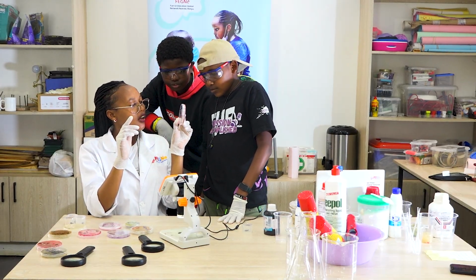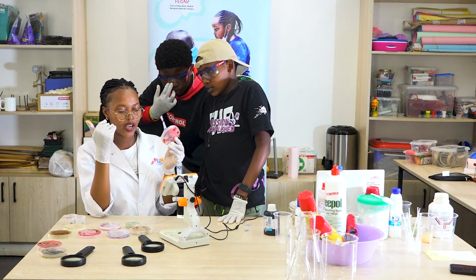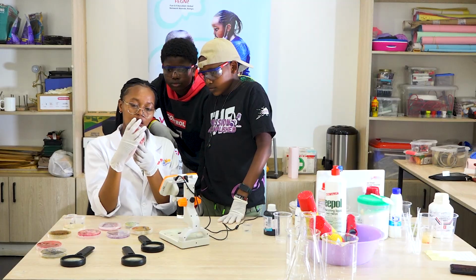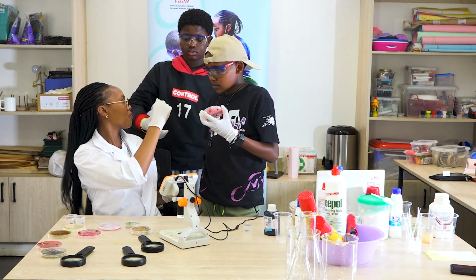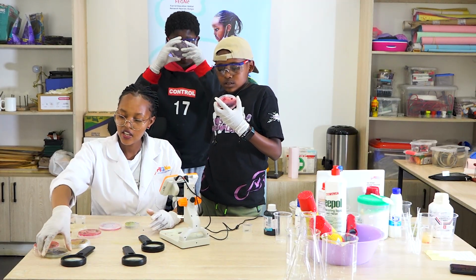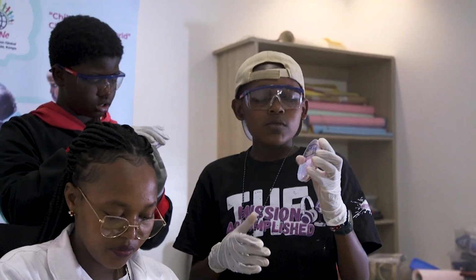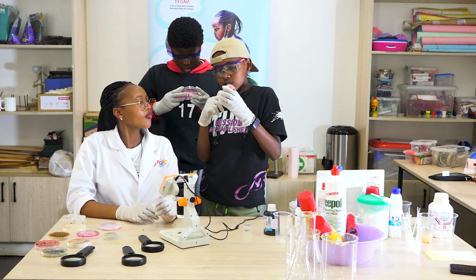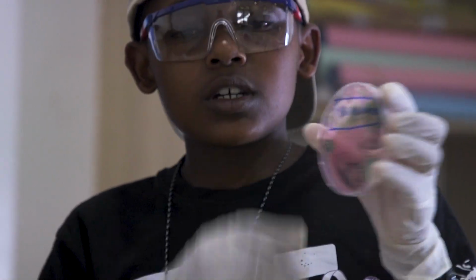We said we studied it via our eyes and also through the microscope. So describe how this fungi appears, and also this is a bacteria. So you have a bacteria and a fungus. You can see that it's growing in patches, but some of it is spread out, and it also has a white lining if you look around it. And then it also has some white patches over here, so you can see the bacteria growth.